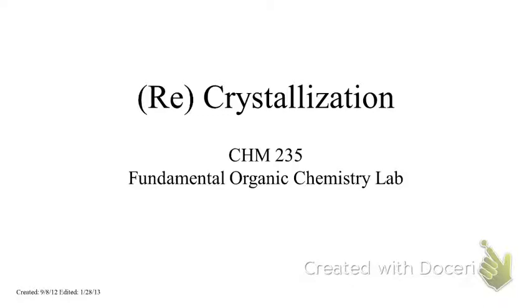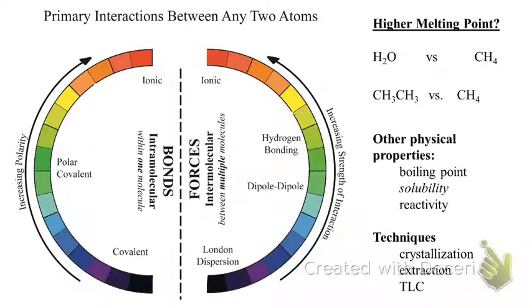We're going to be doing recrystallization. One of the things that's going to become more and more important for each of these is being able to recognize your intermolecular forces. Go through, understand this chart, understand what it means and how it's functioning. We used it to interpret melting points.